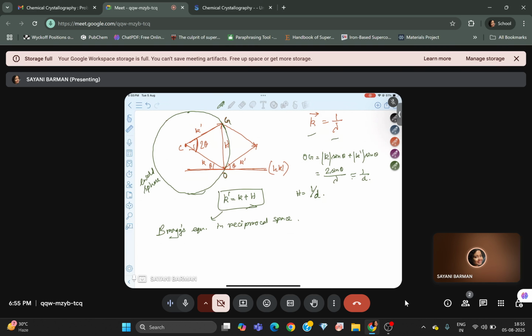Now, this vibrating charge, such as an electron, emits radiation which is in phase, or coherent, with the incident X-ray beam. The drawings I drew a little before, case one, case two, like in phase, out of phase, or partially out of phase, whatever. Now, this electron therefore acts as a secondary point source of X-rays.